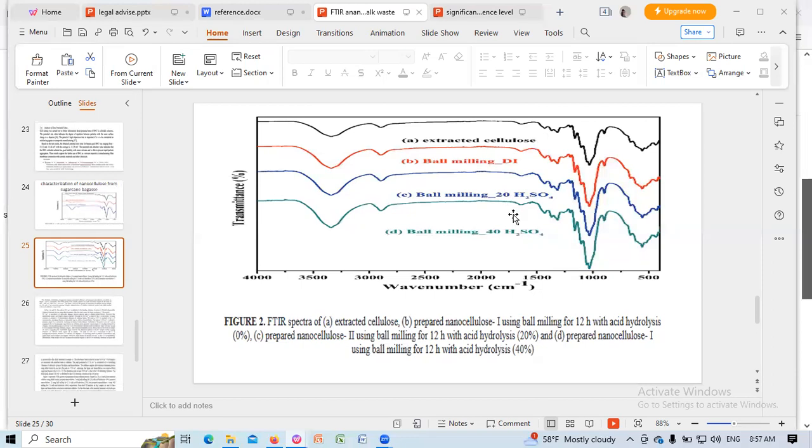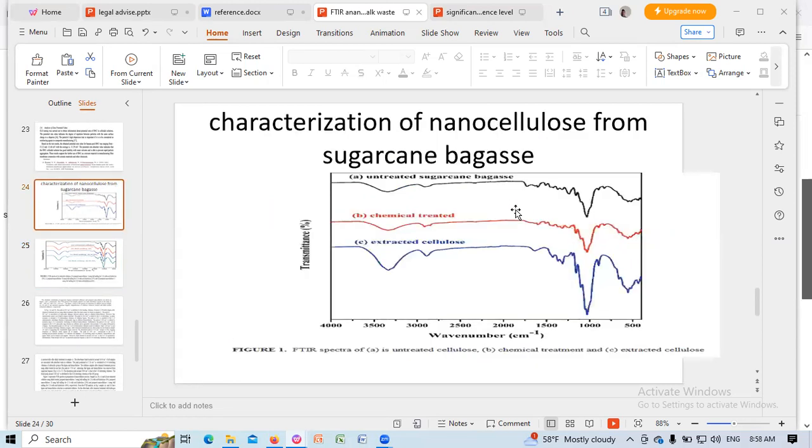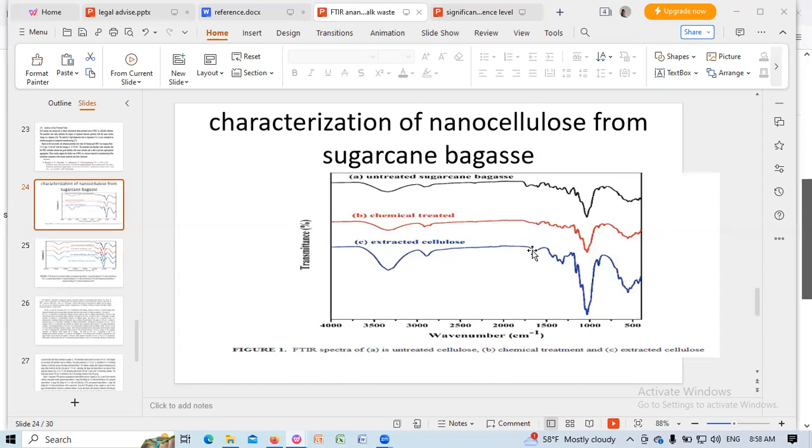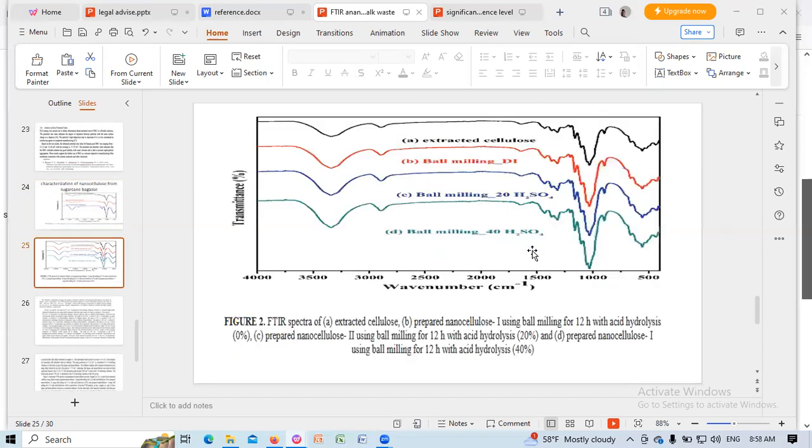1728 per cm, CO stretching vibration of carboxylic group of lignin. In case of nanocellulose, 1728 per cm peak is not seen due to hemicellulose and lignin being removed.